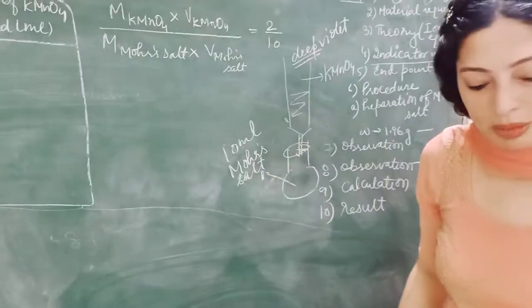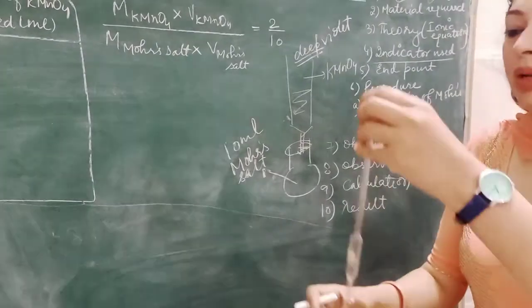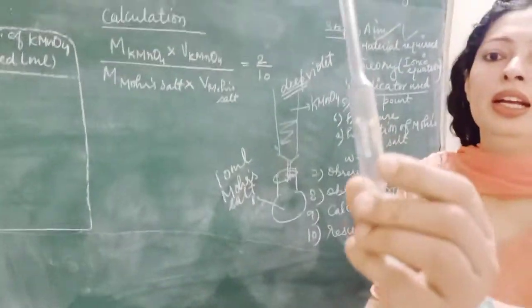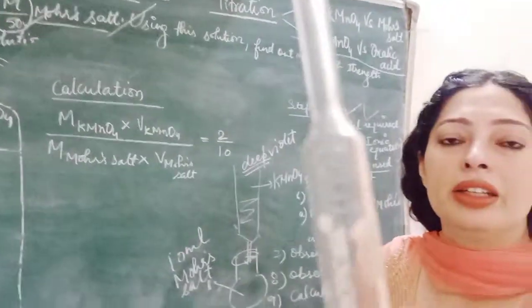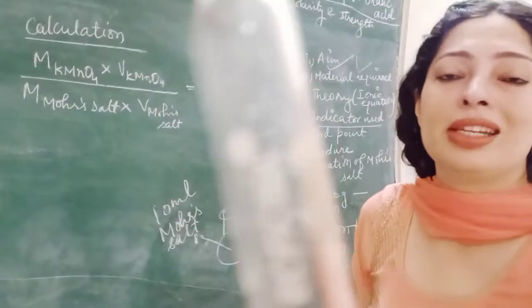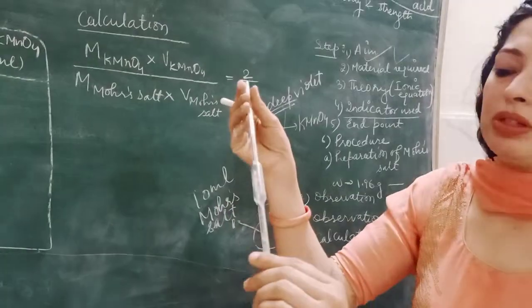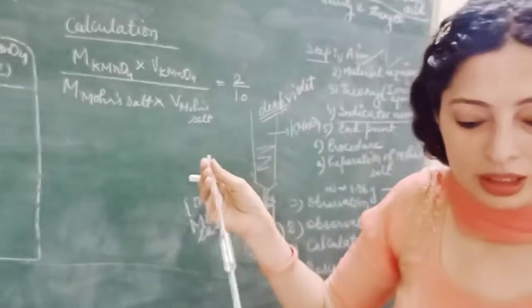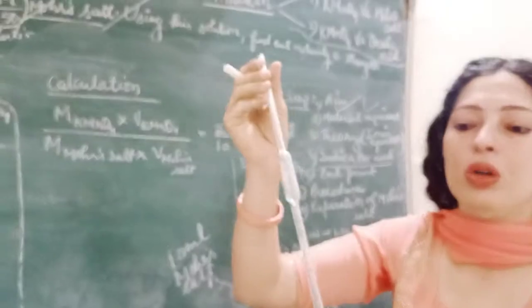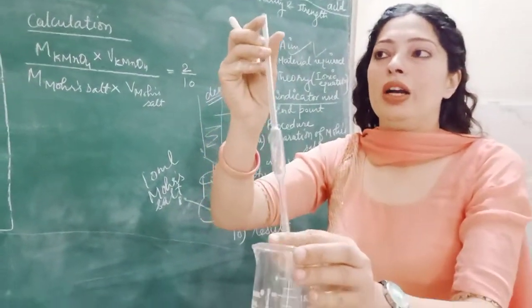In this flask, we will add 10 ml of Mohr salt, which we will pipette out with the help of a pipette. You will use a 10 ml pipette to add the Mohr salt into the conical flask.